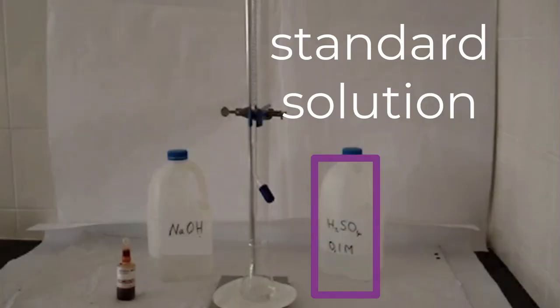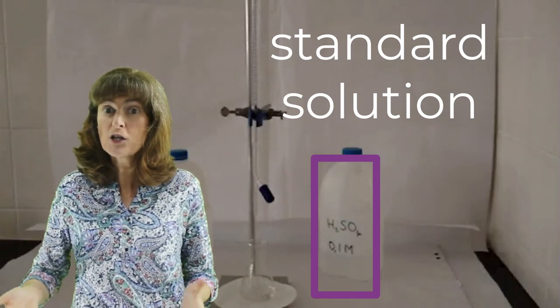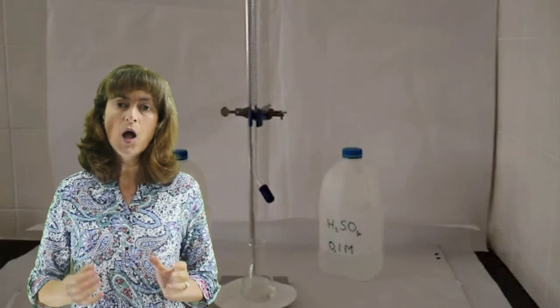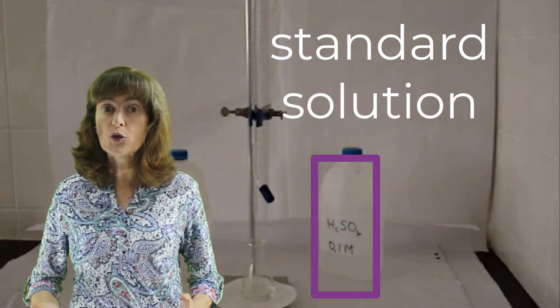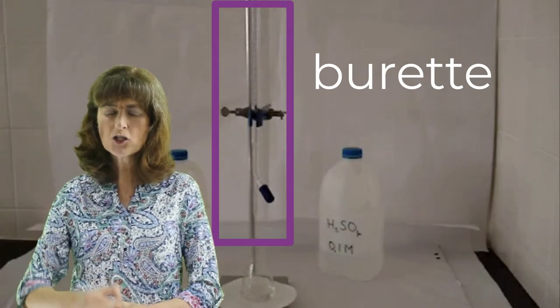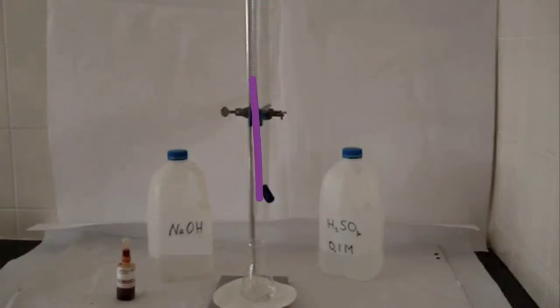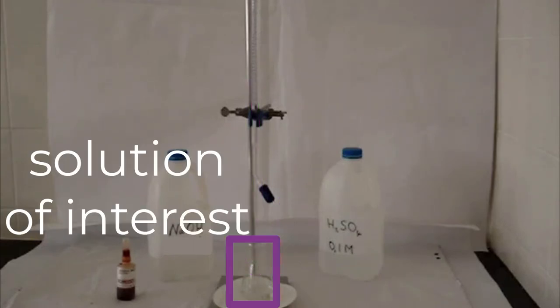What do we do with the standard solution, and how does that help us to figure out the amount of our solution of interest in that flask? We pour some of the standard solution into a burette. A burette is a long glass tube with volume markings on it, and it's got a tap at the bottom. And we add just the right amount of volume of standard solution to our solution of interest using it.